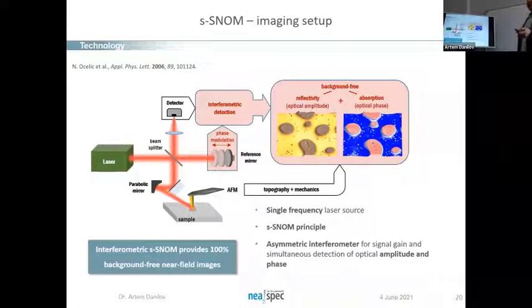Instead, you're removing the background inclusions because you're translating the mirror and you see that the constant part is basically the far field. So you shouldn't go to tricky schemes here. You can just remove the part which is not changing. Yes? So you are not scanning with your sample during this measurement? I do, so you still scan.